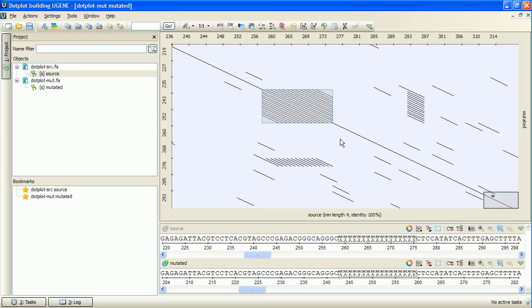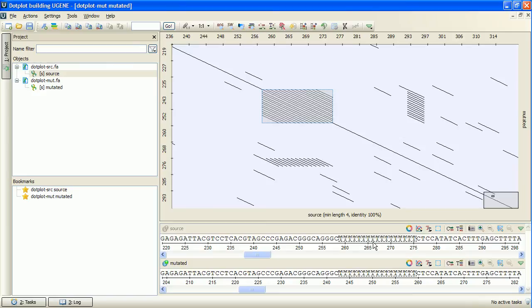By comparing a sequence with itself, you can search for such regions within a sequence. We see at the details view that the corresponding parts of the comparing sequences actually contain only redundant thymine.